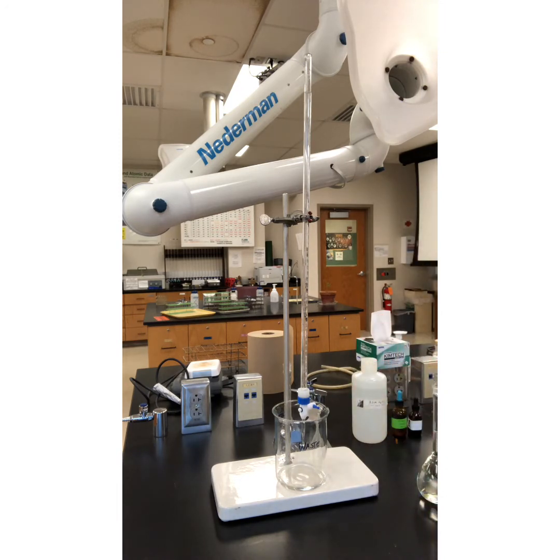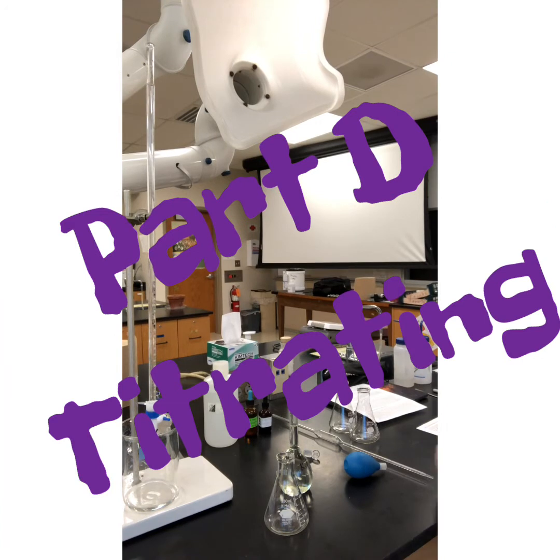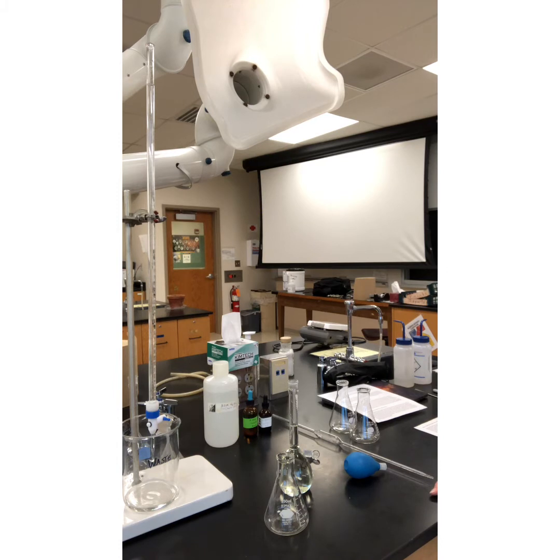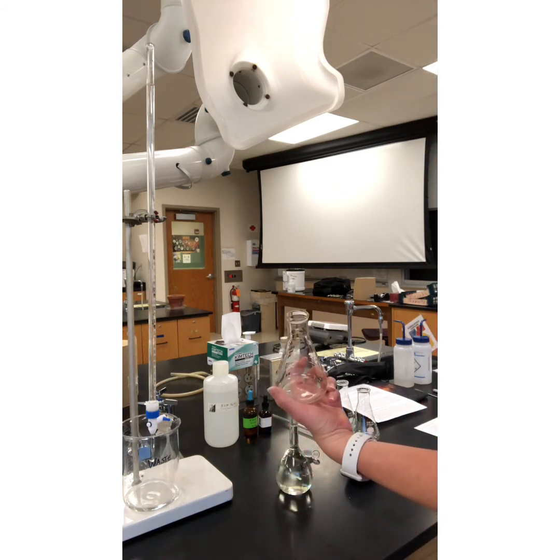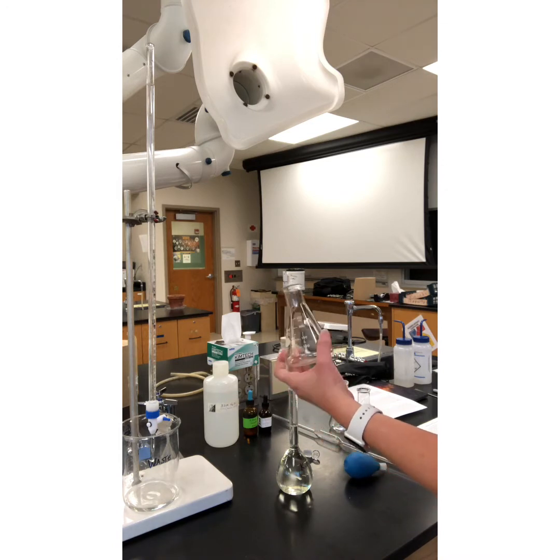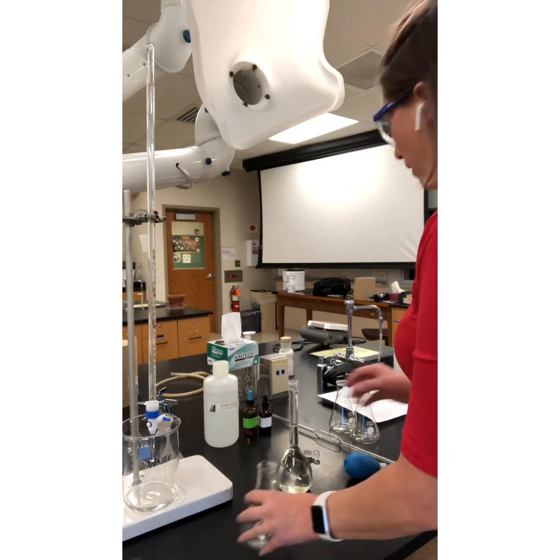So let me move the camera again so you can see what I'm doing a little bit more. Okay, here we go. Part D, titrating. So we're going to go ahead and pipette our 25 milliliter aliquots of our potassium ferrocyanide. Cyanide. I keep saying that funny. So we're going to practice pipetting, and we need to run through this procedure 3 times. I've got 3 250 milliliter Erlenmeyer flasks. That's these guys here. And I'm going to do all 3 portions of my pipetting, because it's a pain in the butt, and I want to get it over with.